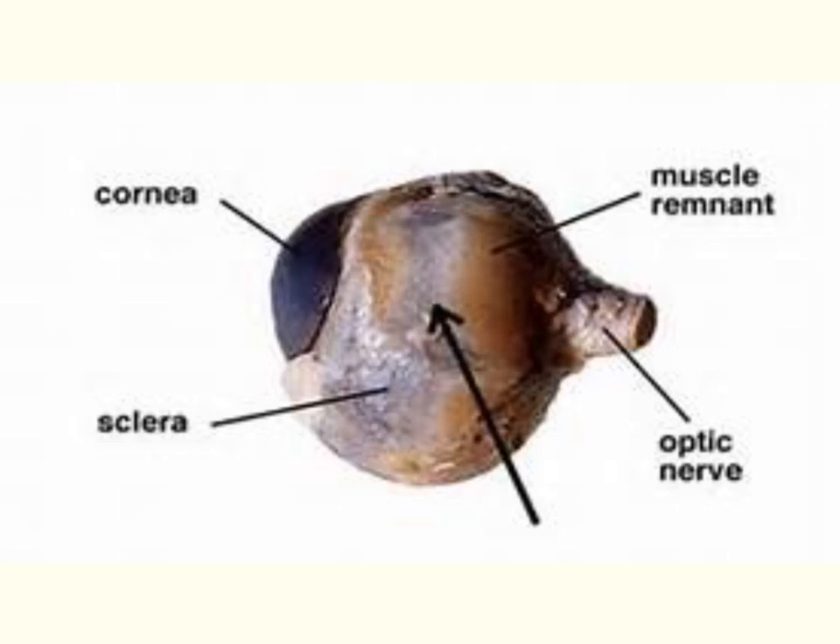When you receive your sheep eye, you will notice that many times it will be covered in yellow fat material, and sometimes it will still have the eyelid and eyelashes present. You will need to use your scissors to remove all of that fat tissue and remove the eyelid and eyelashes, continuing until your eye looks similar to this diagram.